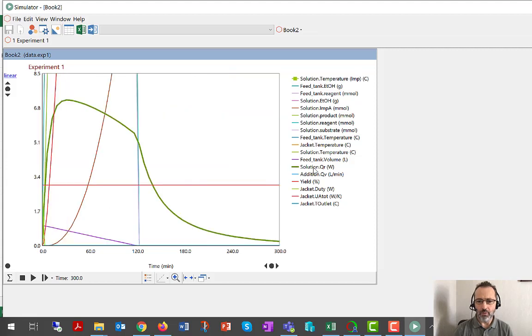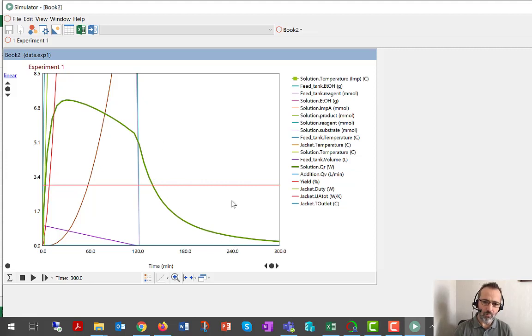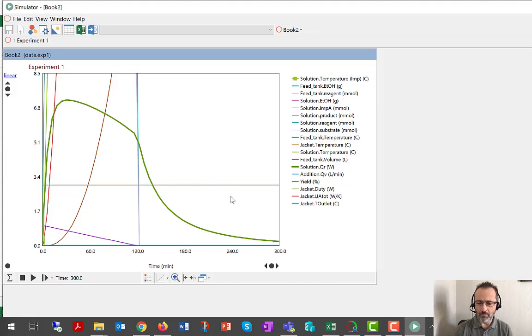We can examine the heat flow profile, the QR profile that our RC1 or different kinds of easy max could measure. And we can see this is somewhat more kinetic than we've seen before. So more of the chemistry happening after the feed, more accumulation. That's because of the lower reaction temperature.